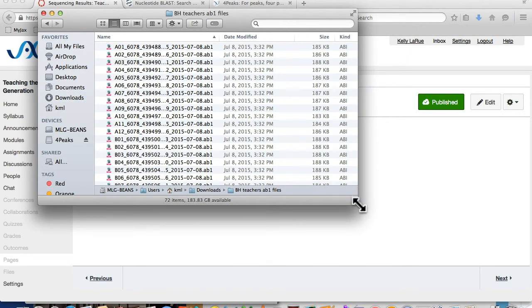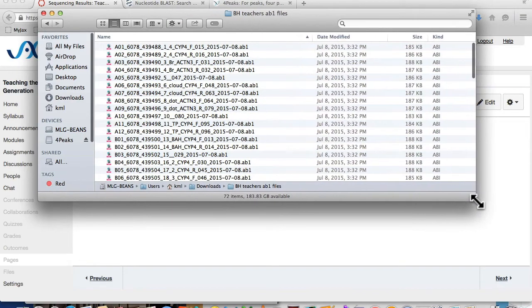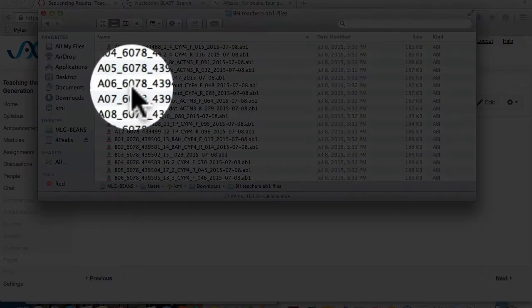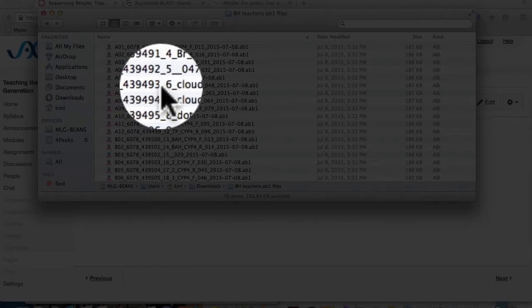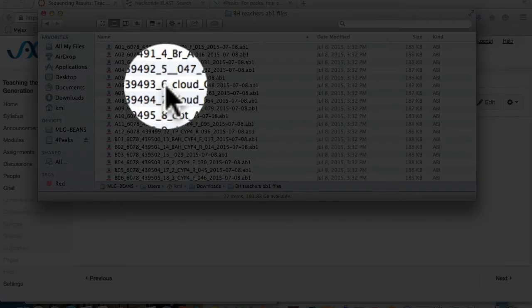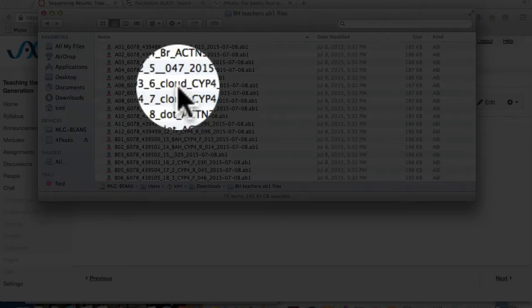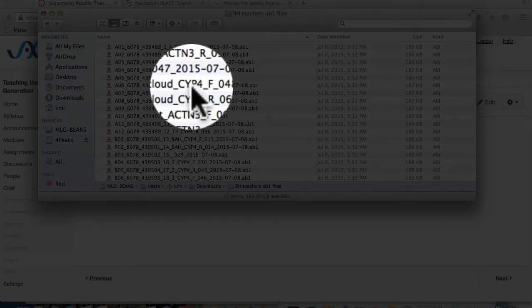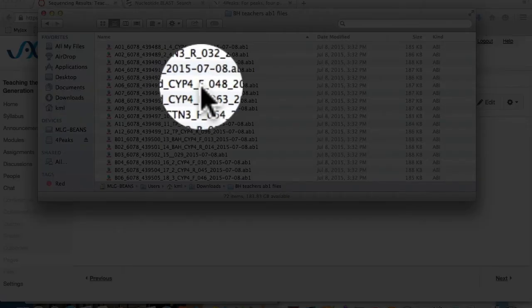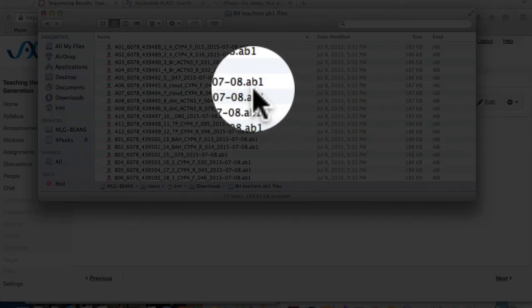The data files have long, complicated names, but the designation you should pay attention to comes after the 10-digit barcode. You can find your sample by finding the sample number, or the sample name, followed by the target gene, and the direction of the read. For this analysis, we are specifically interested in AB1 files, which can be read by the downloaded sequencing software.